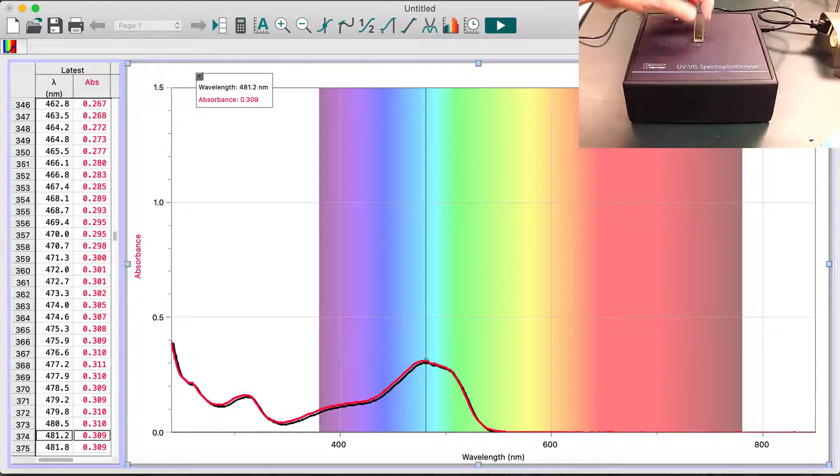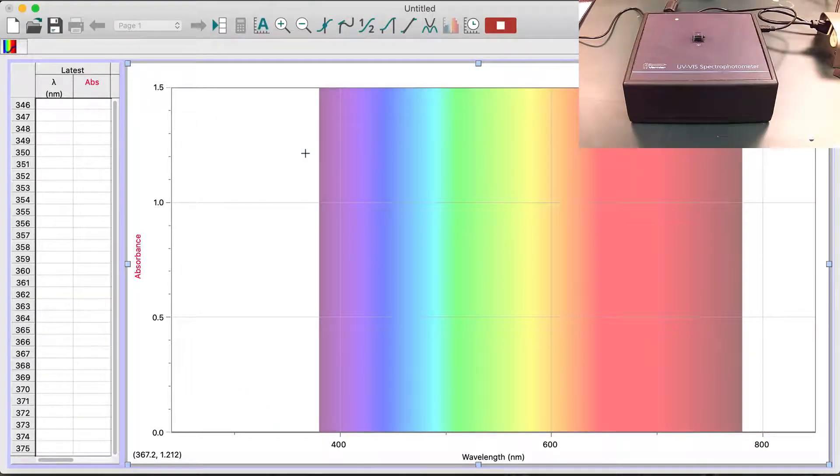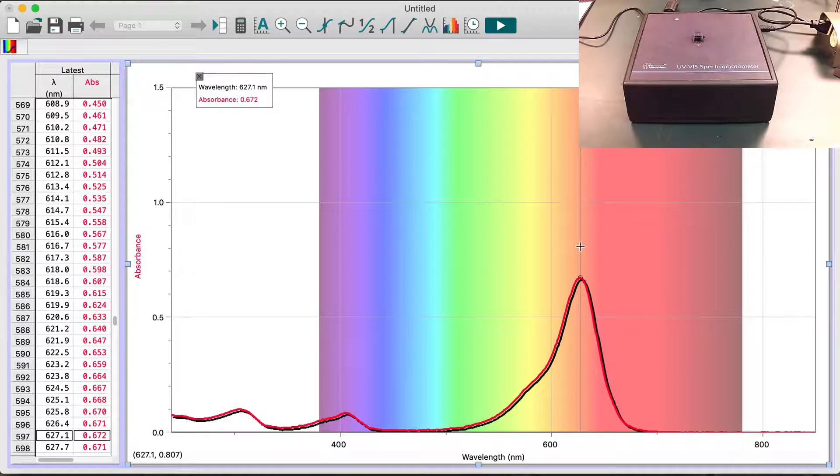Now let me switch to the blue food coloring. Here's Blue Dye Number 1, and here's its absorbance spectra. The absorbance peak has a wavelength of maximum absorbance — lambda max — of 627 nanometers. So that covers the food coloring dyes.